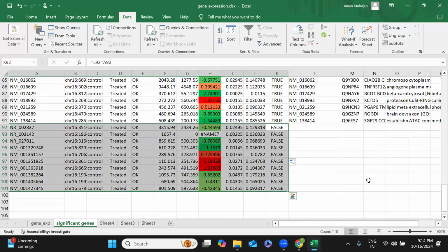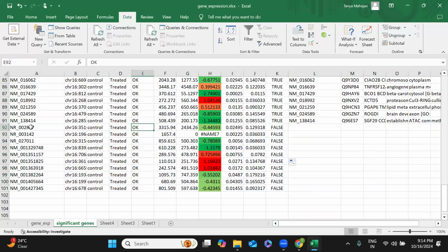Sometimes the research is still going on. That is why I have pasted it below, because we cannot lose the data, right? Sometimes the databases are getting updated, right? So at that time you have to go again to the NCBI just to know whether other information is there or not, and you can complete your data.